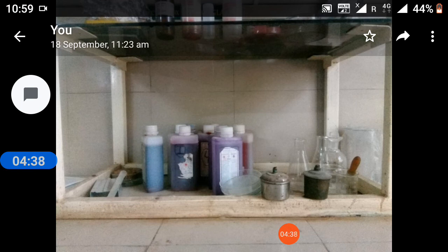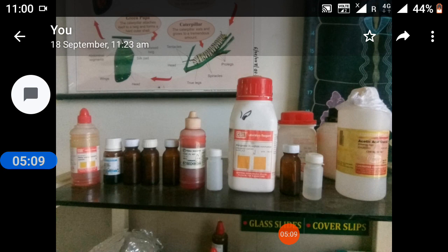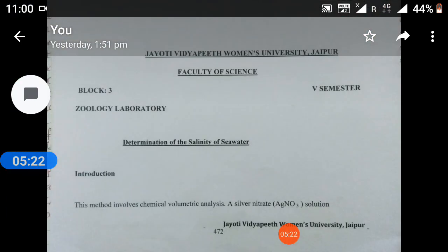Record the volume of silver nitrate added, and thoroughly wash your hands before leaving the laboratory. Data analysis and concept development: From simple algebraic proportions one can determine the chlorinity of seawater, because it has been shown experimentally that the salinity is a constant 1.80655 times higher than the chloride level. Thus the salinity can be calculated. Determine the number of moles of silver used in the titration, then determine the number of moles of chloride in the sample, and determine the grams of chloride present. What is the chlorinity of 10 grams of sample? And what is the salinity of the sample?